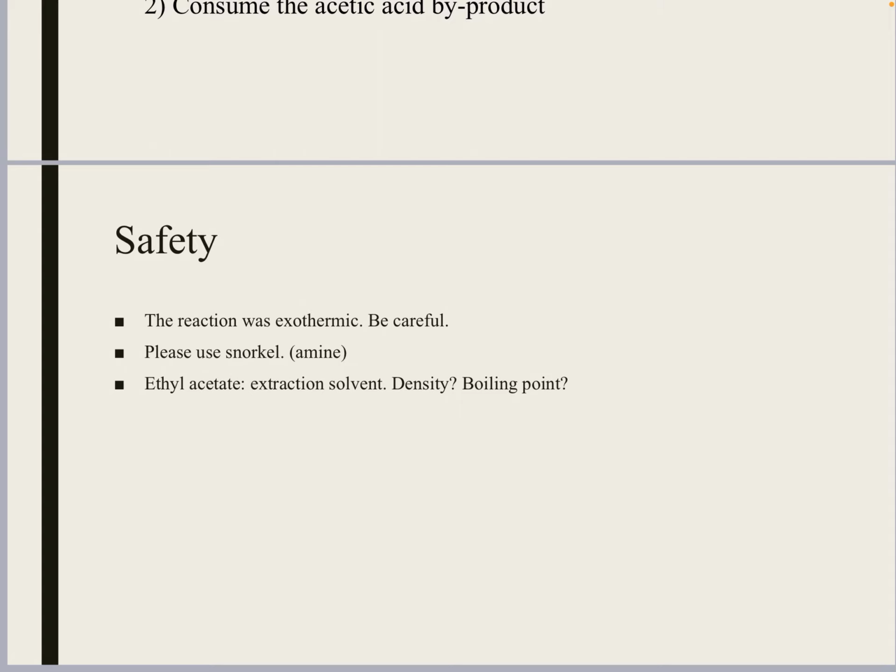If the reaction goes very violently, slow down the addition of the reagent, okay? And you may also swirl the flask after the addition of the product, because sometimes the reacting reagent will be splashed onto the walls of the flask. So in the end, they do not even participate in the reaction.